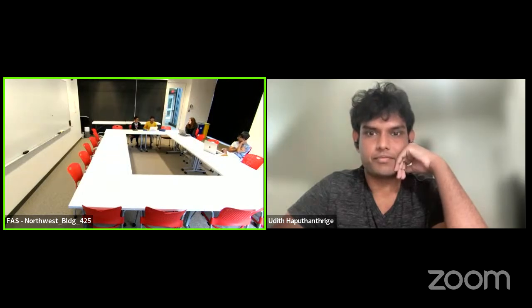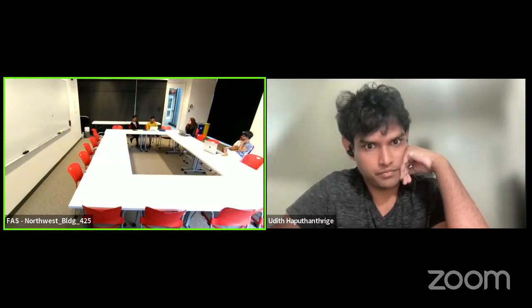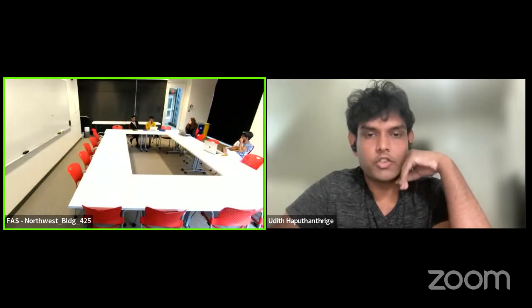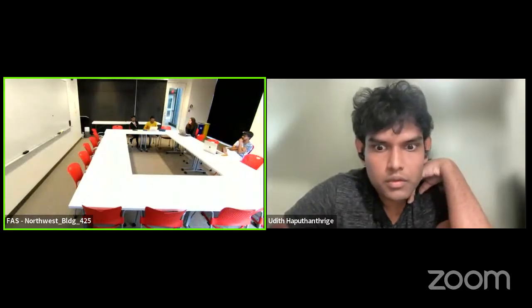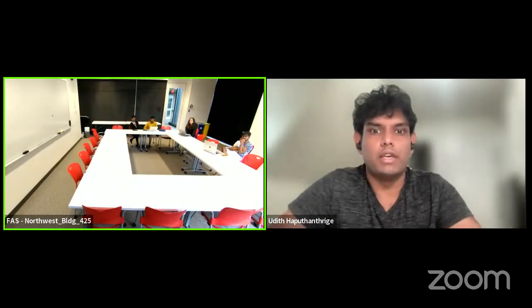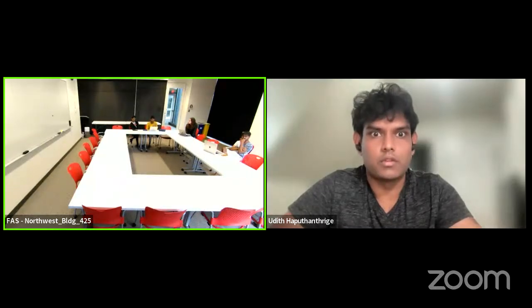When getting the best pinhole size for the confocal, in that slide, is it done with respect to the ground truth image? Sorry, can you repeat that again? You mentioned you do some grid search to find the best pinhole size for the confocal. Yes, to obtain a fair comparison, you get the best confocal also. So in doing so, what's the objective when doing grid search?